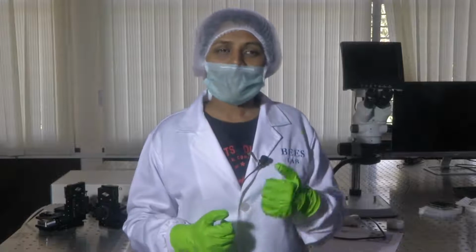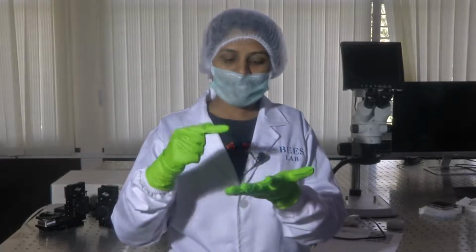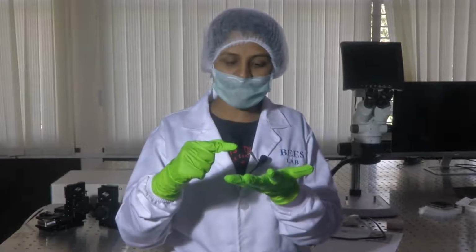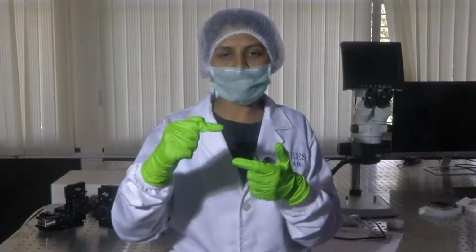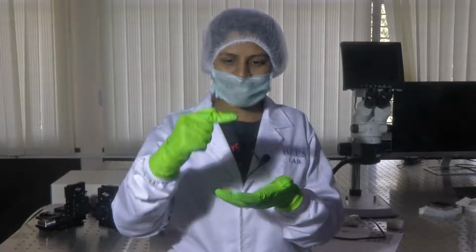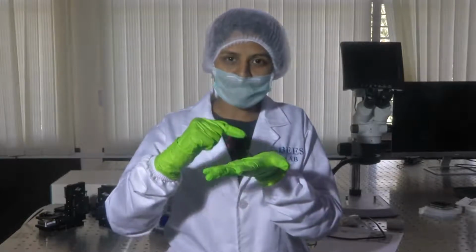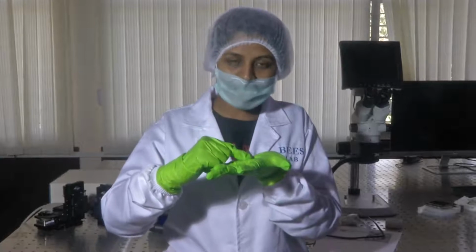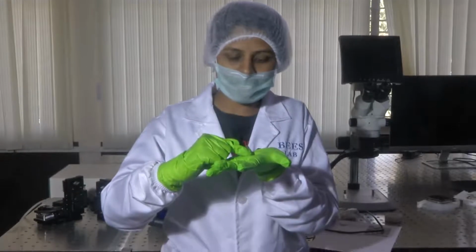A few to mention are cantilever-based sensors. These MEMS-based cantilevers are used in AFM, the atomic force microscopy techniques. The working principle is that the cantilevers are indented onto your tissue sample and, as they indent, they are pushed back because of the inherent elastic properties.